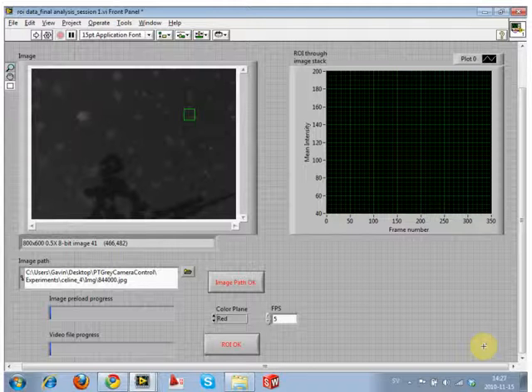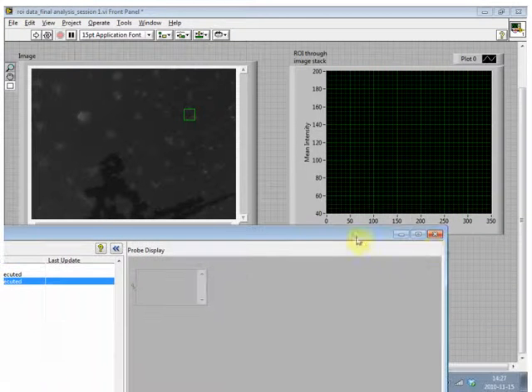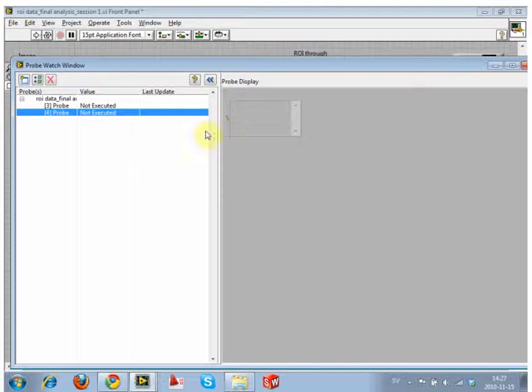What you would have to do is do that same thing. Keep the light bulb on and look at each line, probe each line and see where all the probes are. Because right now, I had a couple of probes active that would have each shown me the same thing. It would say, the file extension is wrong. By probing, I can go over those.